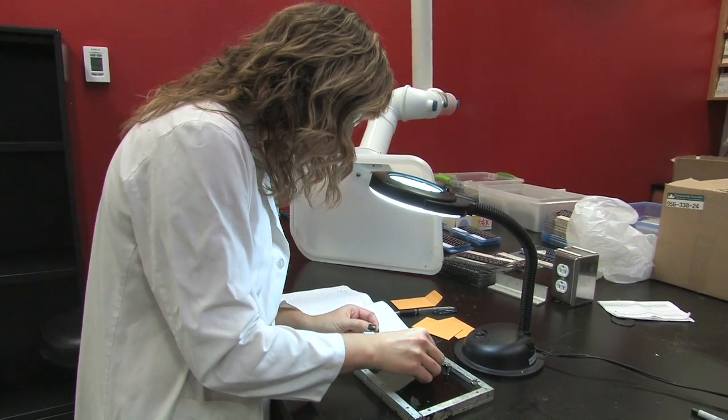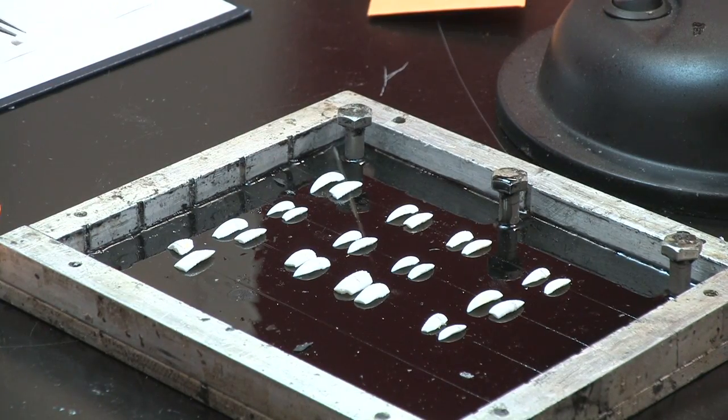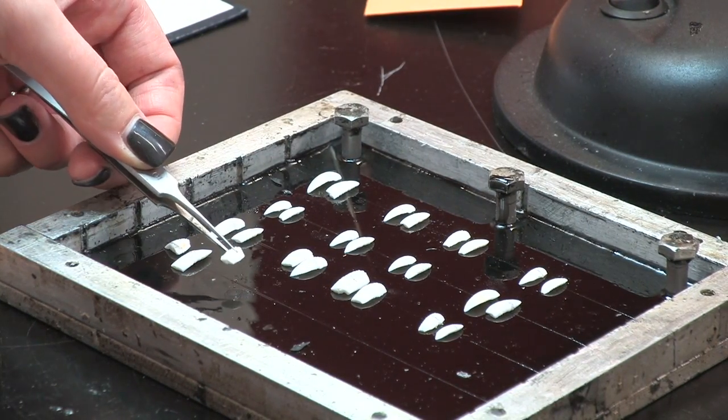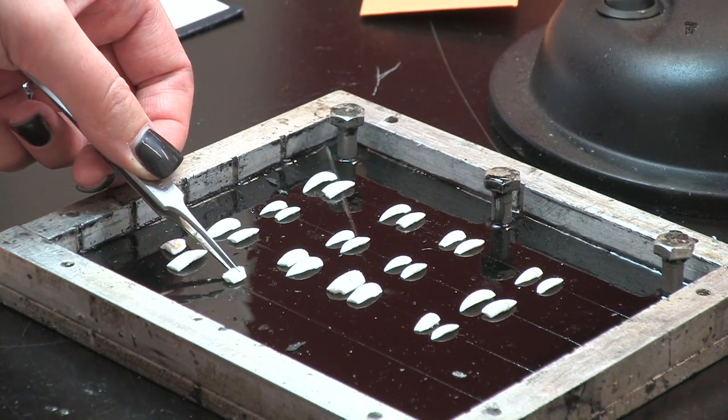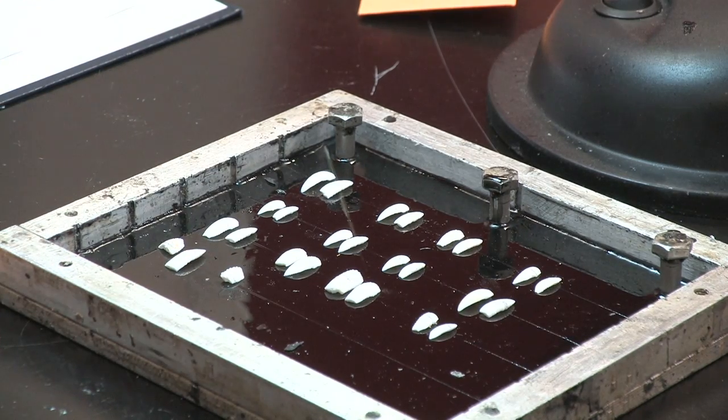You can still use broken otoliths. Typically a break will happen right around the middle but as long as you can still mark the core the otolith can be embedded as would other otoliths by aligning the core with the etched line on the plate.